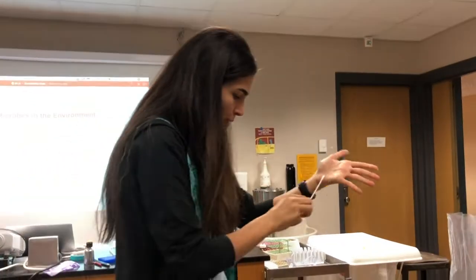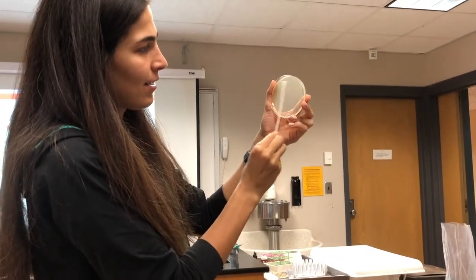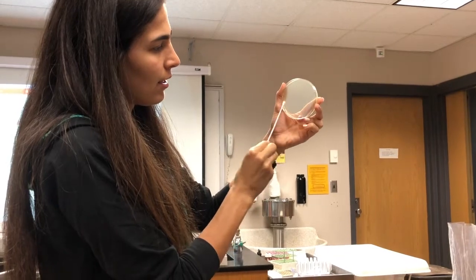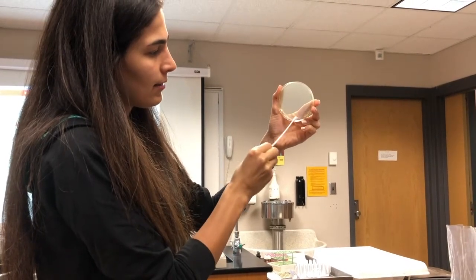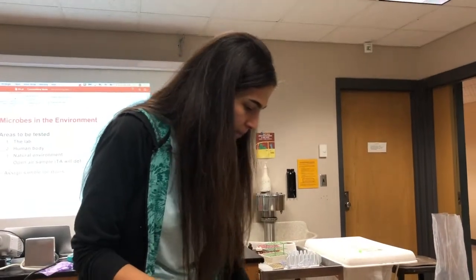Hopefully there will be no microbes in my hand after washing. Back and forth until the end. Close the lid.